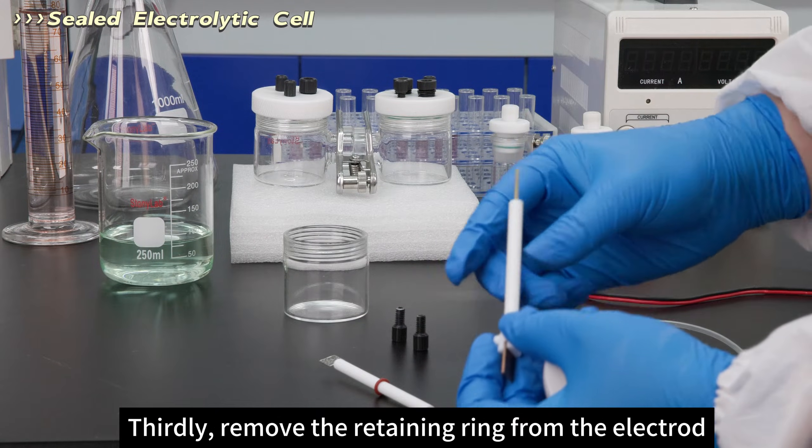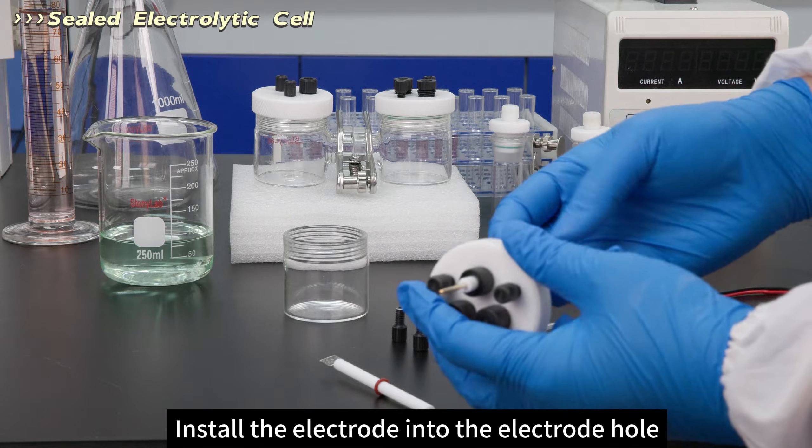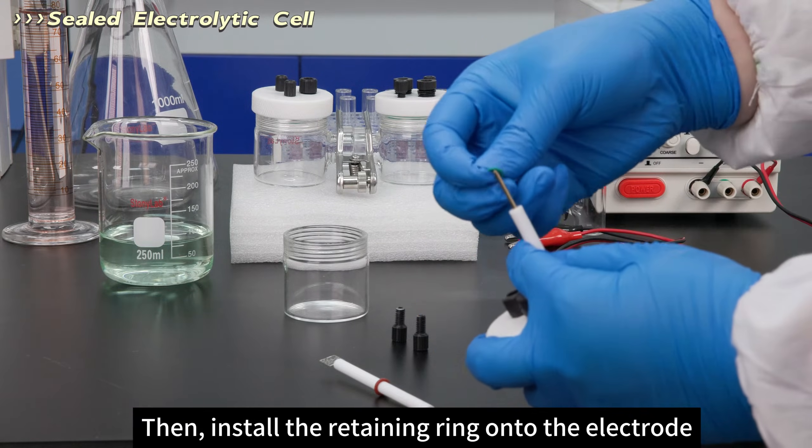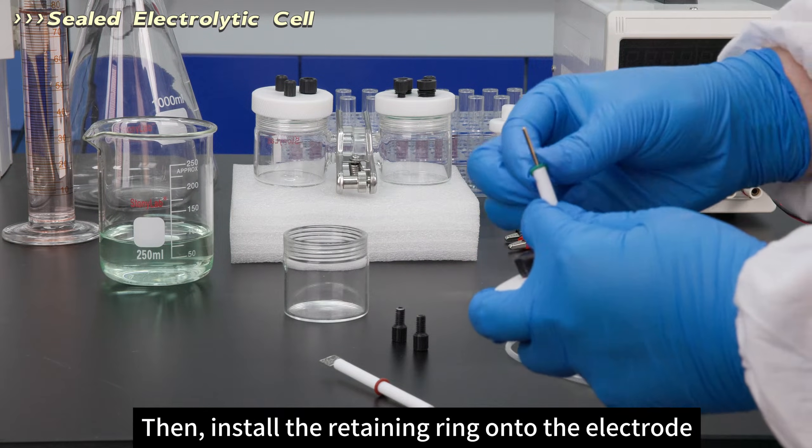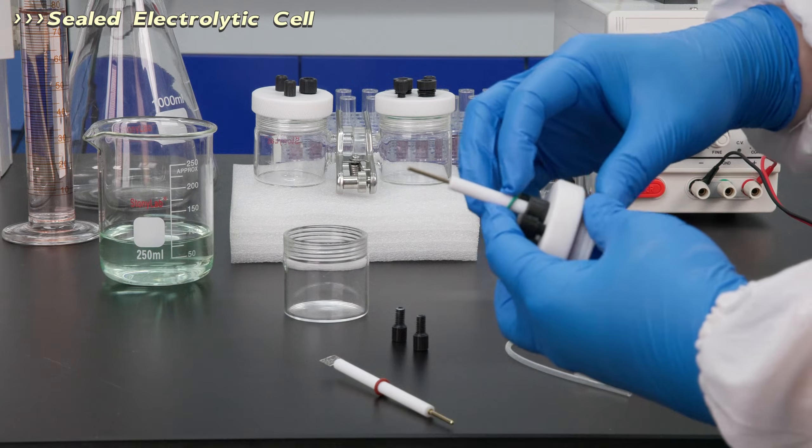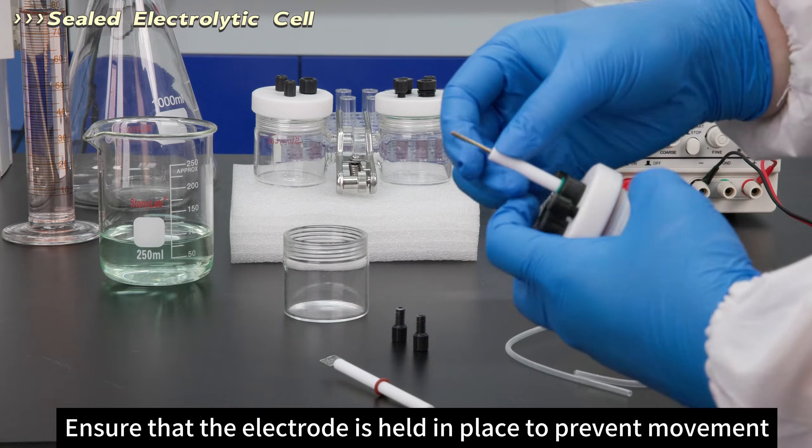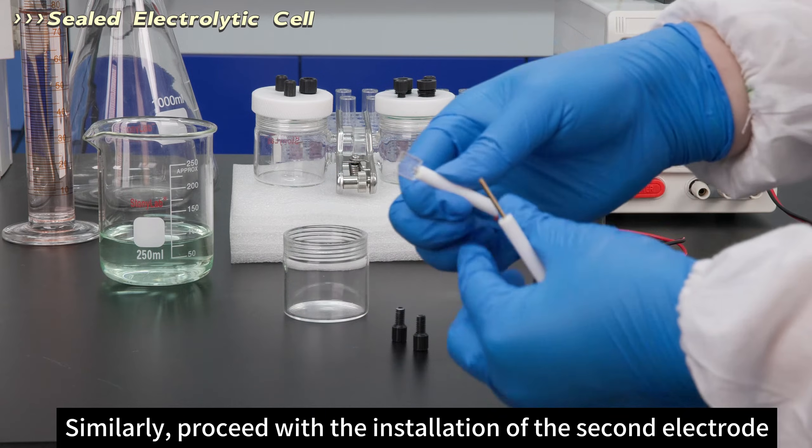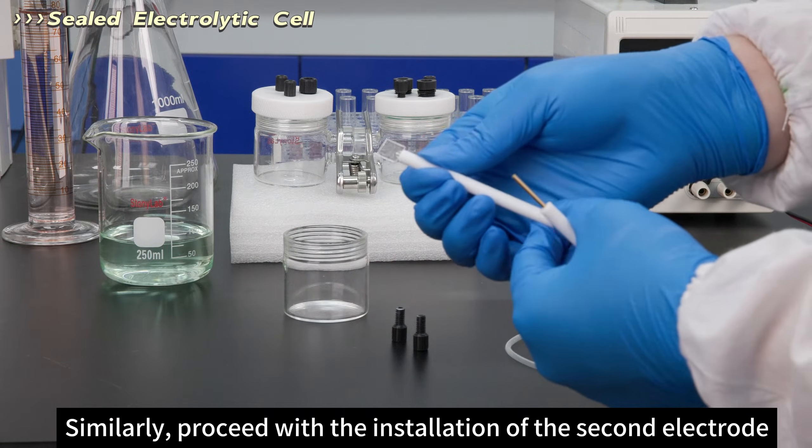Remove the retaining ring from the electrode. Install the electrode into the electrode hole, then install the retaining ring onto the electrode. Ensure that the electrode is held in place to prevent movement. Similarly, proceed with the installation of the second electrode.